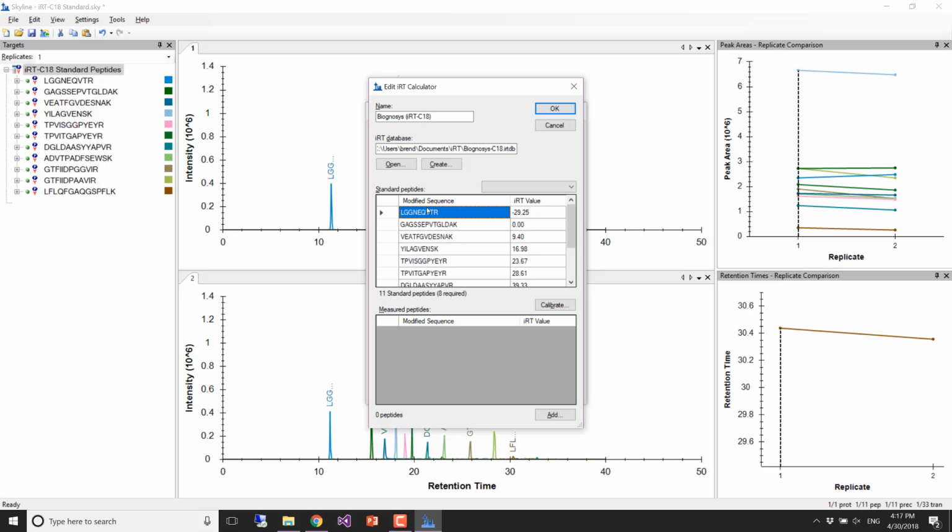They should come reasonably close, but you could also just soldier forward. I have seen large data sets where it turns out to be better to recalibrate the IRT values on your chromatography than to use the canonical values, because there will be some variance.